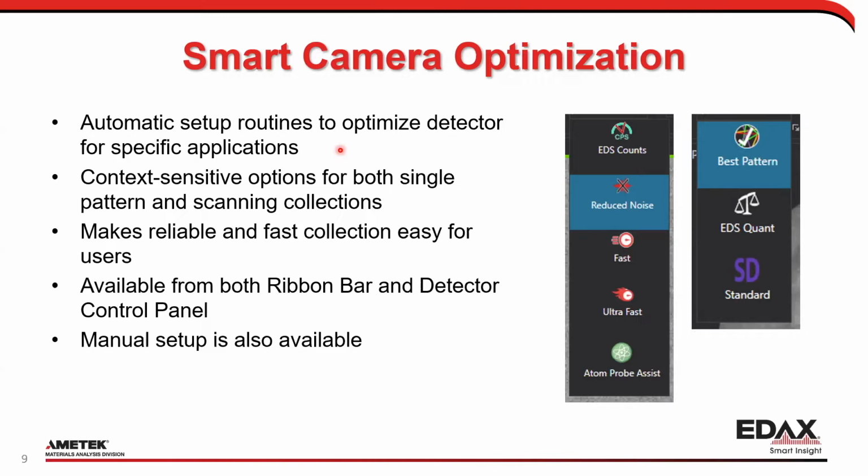Now, why does this matter? Well, if I have my sample mounted in epoxy or maybe on the edge of an epoxy mount or whatever, I zoom out, I'm now often scanning either in free space or the material that my epoxy or my mount is in, right? So because of that, I'm going to put an artifact into my background. And that's one of the reasons I kind of avoid this in general: I want to make sure I have a little bit better control over my background. That said, you can overwrite that background after the fact, but this is why I avoid these. I think if you understand these settings, especially for the Hikari, it's better for you to do it because you're basically picking and choosing and making a choice instead of saying, hey, algorithm, do it better.